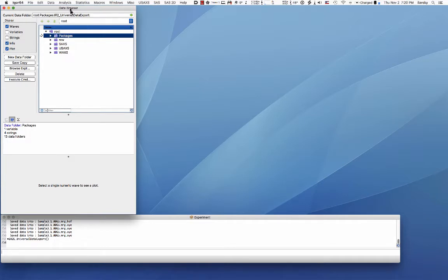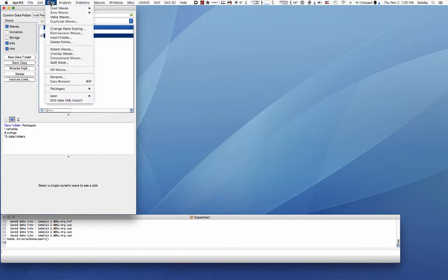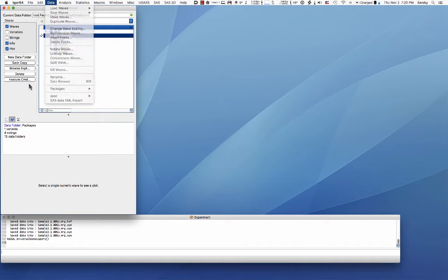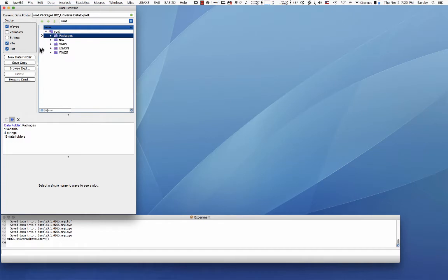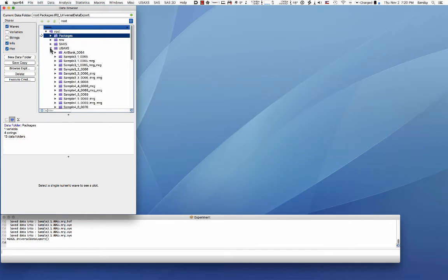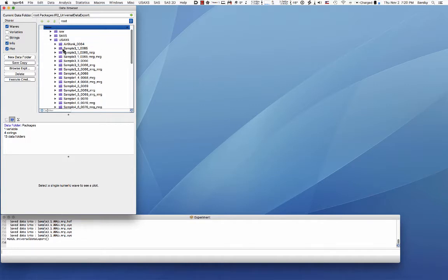So if you generated USAXS data inside the data browser, if you don't know what data browser is, if you don't see it just open it up with the data browser from the data menu in Igor. If you have reduced the data in USAXS folder itself you will have some set of folders which will have your sample name. So here's a sample name 3_10665.